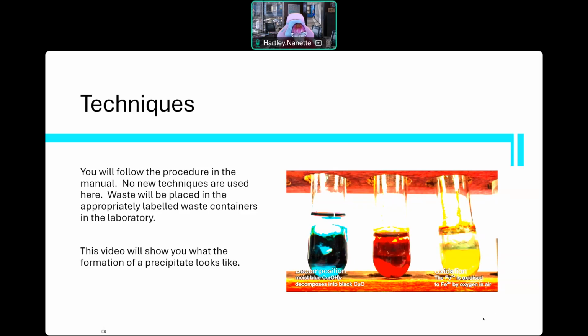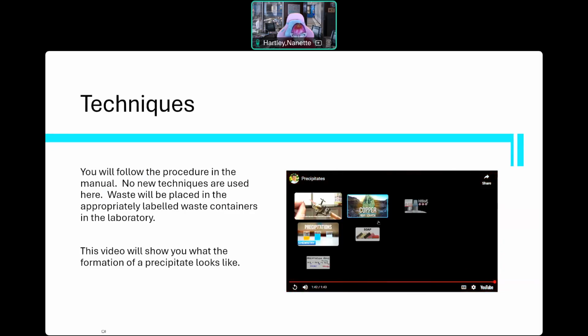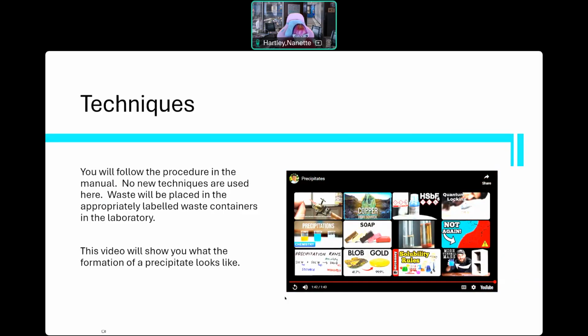Sometimes these reactions do take some time. So they may not be instantaneous. You noticed when we were looking at this that it did take some time for these to happen. This one particularly, we had to take a little bit of time to get it to show up. So they're not always instantaneous. The lab manual does say that you need to wait for 3 to 5 minutes for these precipitates to form. So you've got to do these reactions and then wait for them to happen.